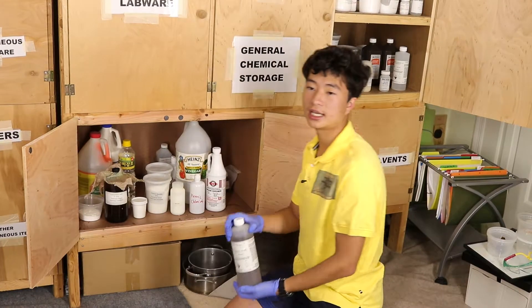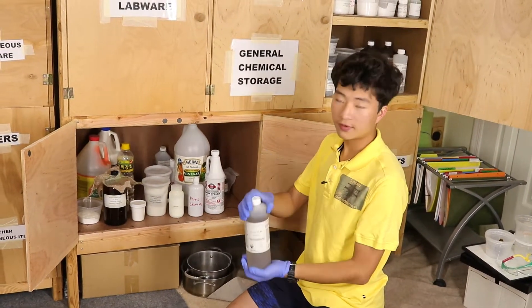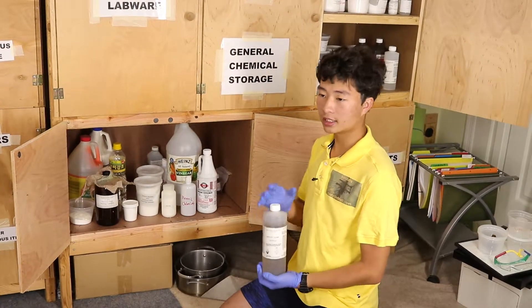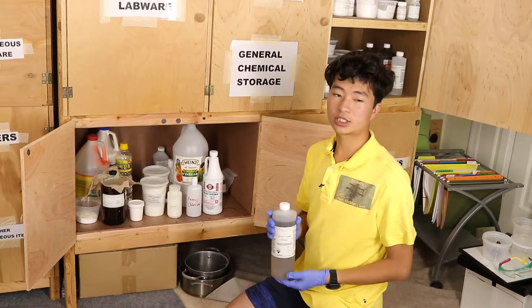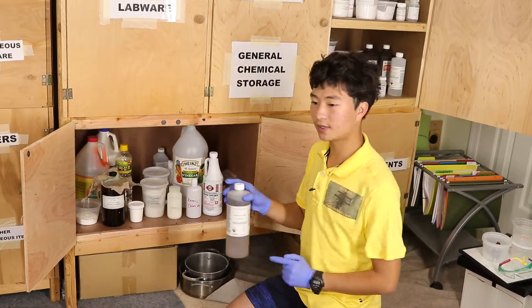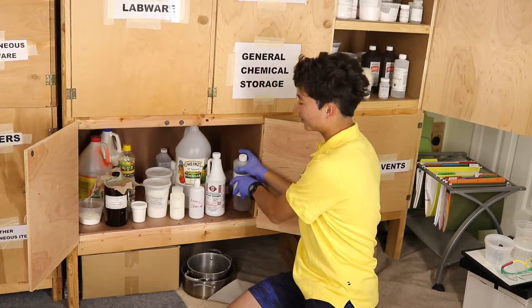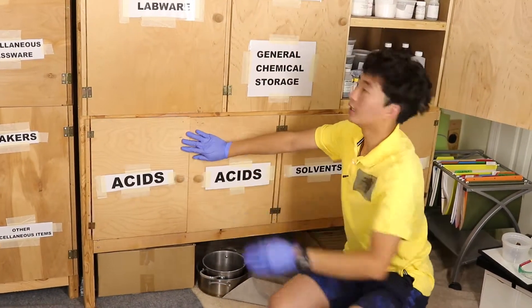We have 98% H2SO4 right here. This stuff is actually quite dense — much heavier than you'd expect the bottle to be — and it's very dangerous. If you put some on your arm it will melt through your skin; it will actually char because it wants water so badly it will pull it from your organic molecules. But it is a very useful acid, so that's one thing going for it.